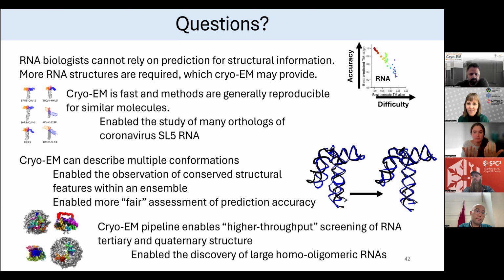So we did not make any major conclusions off of that. But the loop positioning is something we can't see at that type of resolution, right? So I think it's less of claiming it's solved and more of knowing what information you can confidently deduce from structures at given resolutions.